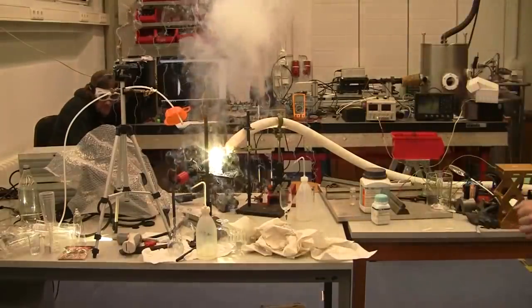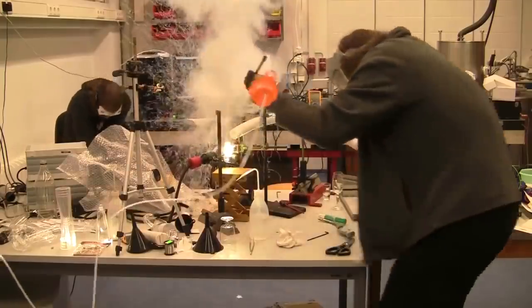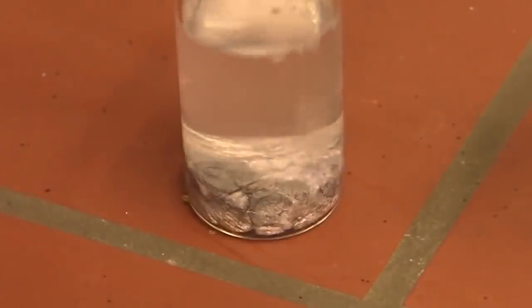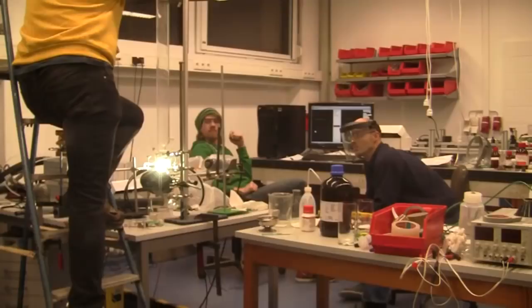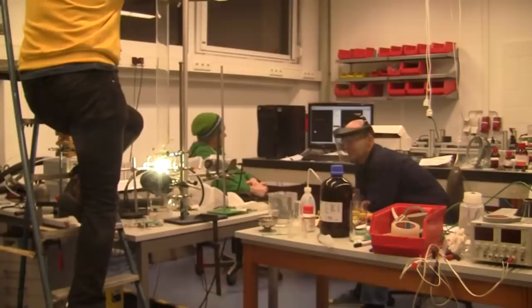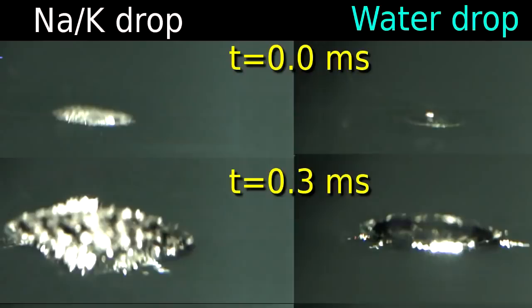So previously, after some rather exciting preliminary experiments, we managed to get the alkali metal, mostly sodium-potassium alloy, simply because it was relatively easy to handle, to explode basically on command within a millisecond or so. This led to the discovery of a new mechanism for the explosion of the alkali metals in water. Well, that was last year's science.